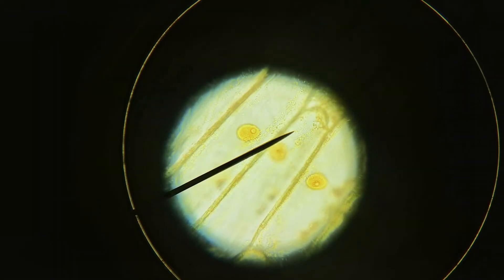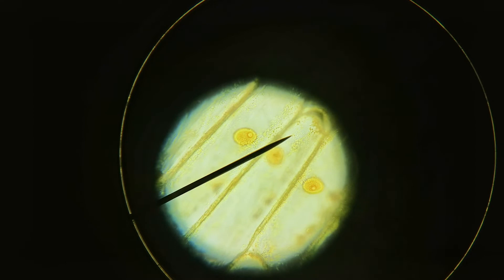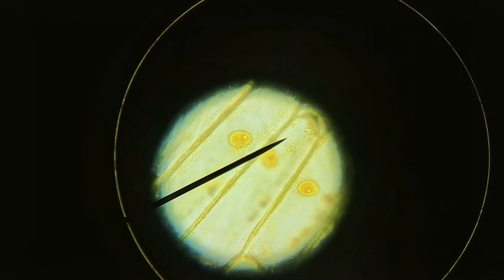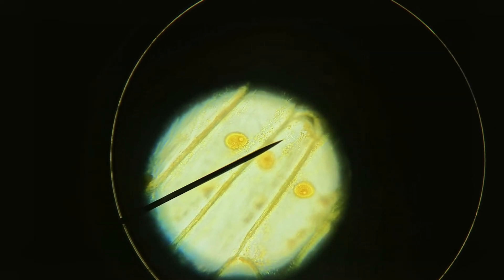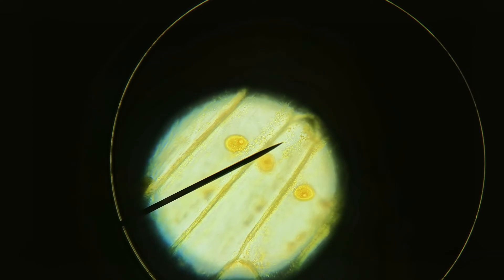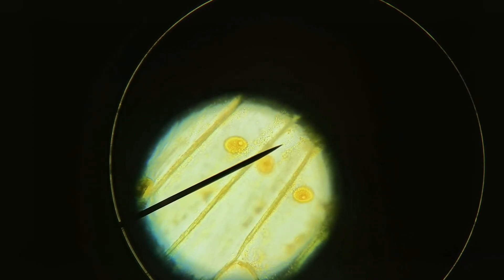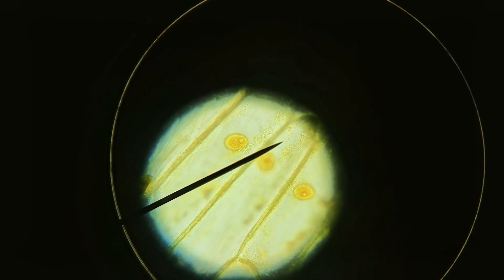Finally, this is using the objective lens with a magnification of times 40. To work out the total magnification, you multiply the magnification of the eyepiece lens by the magnification of the objective lens. The objective lens has a magnification of times 40 and the eyepiece lens has a magnification of times 10, so 10 times 40 is 400. The total magnification we are viewing these onion cells with right now is times 400.